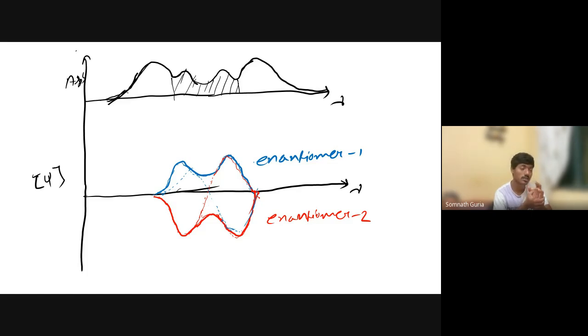The structure of the UV-Vis and the CD spectra may be different, because of one particular transition. Suppose initially we said that both transitions of one enantiomer are positive ellipticity. That may not be possible. Suppose one transition has negative ellipticity. In that case also we get a different spectrum, which can be easily monitored by the CD spectrum.